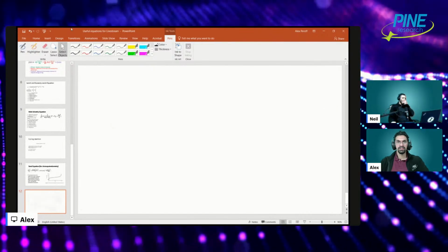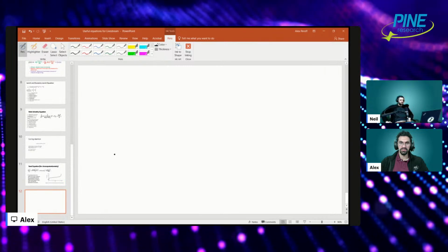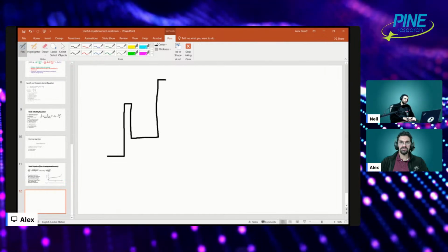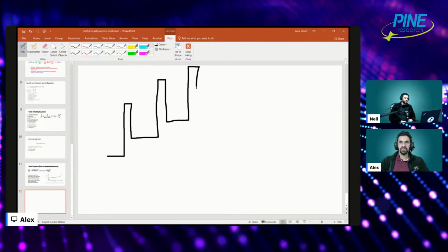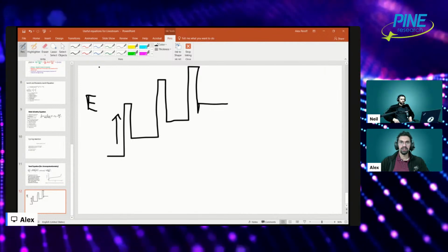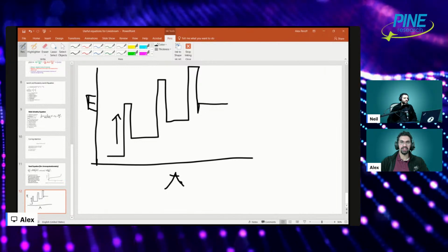So differential pulse voltammetry is another form of voltammetry where we apply a potential and we measure a current. Typically, a differential pulse voltammogram has the following form, where we have these pulses, and we continuously pulse and then wait. So we pulse the potential up to some value. The x-axis is time, and the potential axis is the y-axis here.